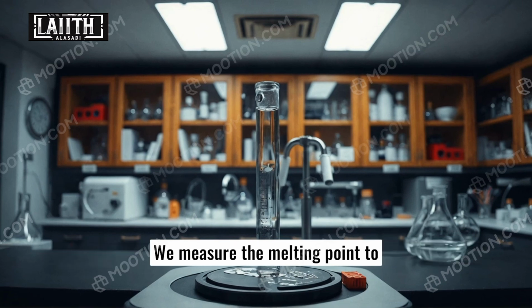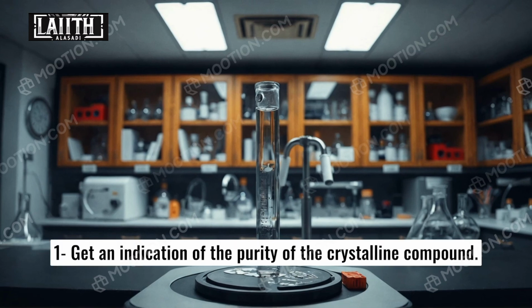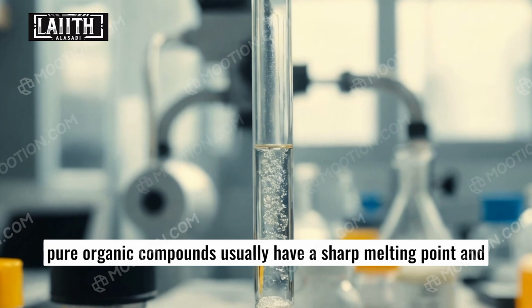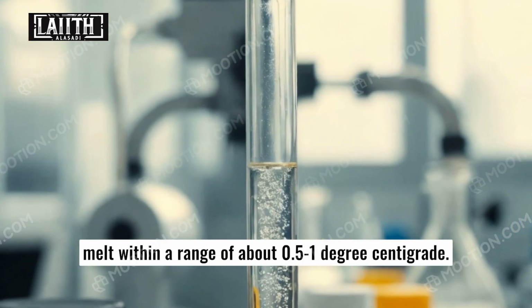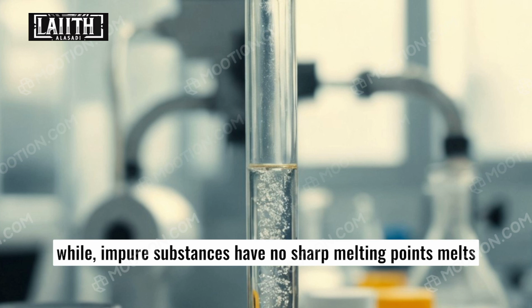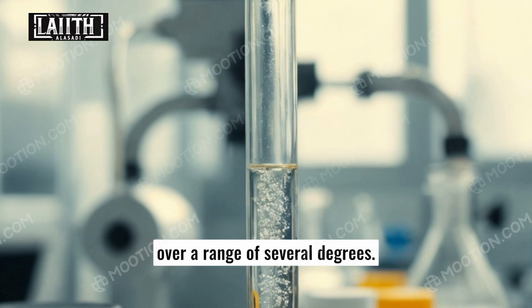We measure the melting point to, 1. Get an indication of the purity of the crystalline compound. Pure organic compounds usually have a sharp melting point and melt within a range of about 0.5 to 1 degree centigrade, while impure substances have no sharp melting points and melt over a range of several degrees.